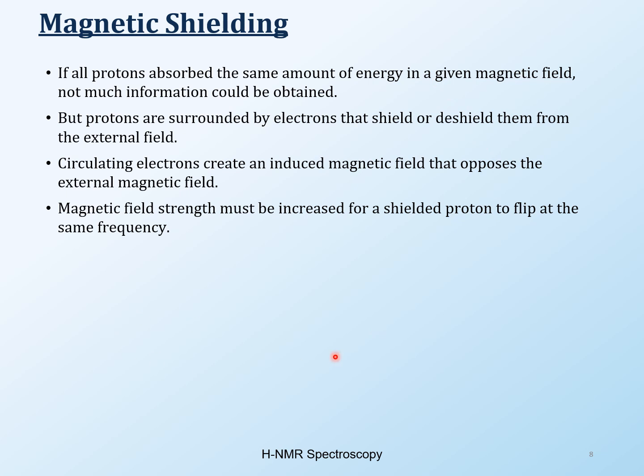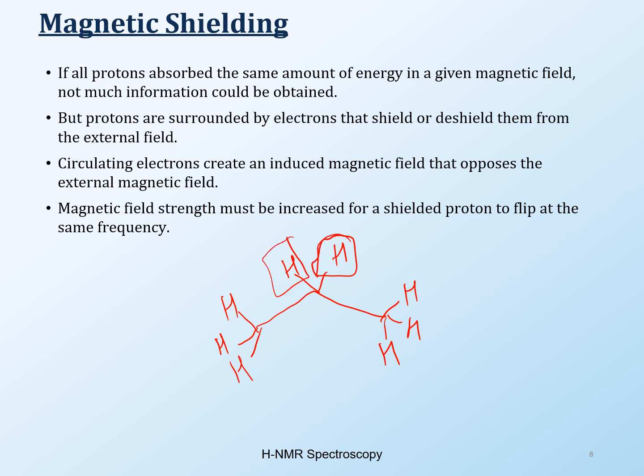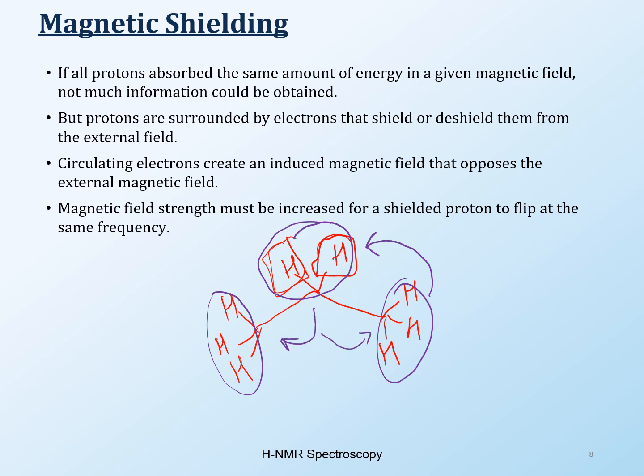So what happens in the NMR is there's more going on here, and thank God for that. When you have your compound, this is why I talk about the environment the way I do, because it helps me figure out how many signals I'll get and where they will be. Looking at this, you can see that these two protons are equivalent, and here these 6 protons are equivalent. These 6 protons are looking at these 2 protons. The other aspect is the shielding and de-shielding going on. There is no de-shielding here, but shielding, meaning these 2 protons are surrounded by electrons.